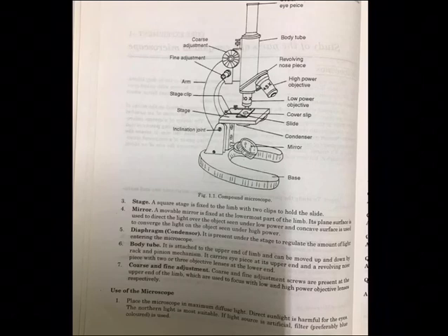Before and after use, clean all the lenses and metal parts, including the stage, with tissue paper. Don't use your handkerchief, for God's sake. Muslin cloth, soft and clean handkerchief. Of course, I advise you not to use your handkerchief. We'll give you tissue paper. Keep the microscope covered when not in use. So keep it inside. Do not remove the objective lenses from the nose piece. Do not remove that. Only the eyepiece can be removed. Handle the screw, condenser, mirror and stage clips carefully. Care should be taken that the objective lens should not touch the slide in any case.